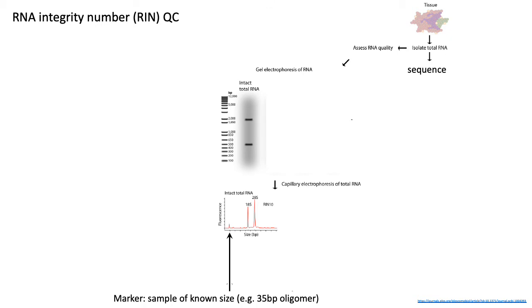For example, if you have not done any RNA selection and you're just looking at total RNA, then you'd expect some pretty big bands that correspond to the 18S and 28S subunits of the ribosome. Furthermore, you should see a pretty high ratio between the 28S band and the 18S band. And that typically indicates little degradation.